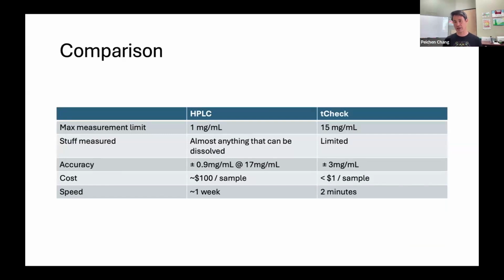And one of them was that we needed to make it really easy to use. So we had to simplify a whole bunch of stuff. And one of the most basic simplifications is that we figured, okay, well, you guys know what the heck you're doing. You know what you're testing for, right? You've taken your cannabis plant material, you've decarboxylated it, and so therefore, it should be just THC in there, and so that's what we're going to look for, right?